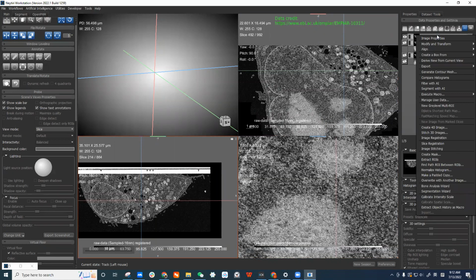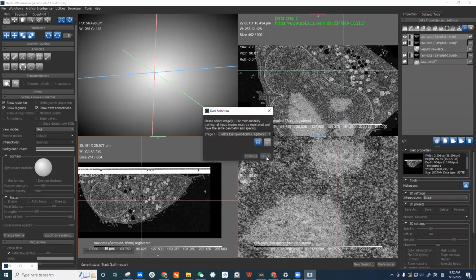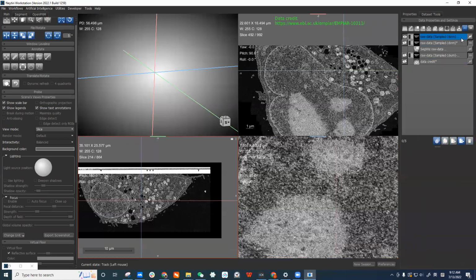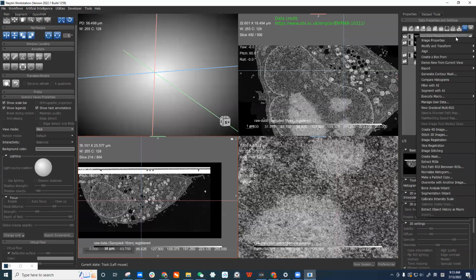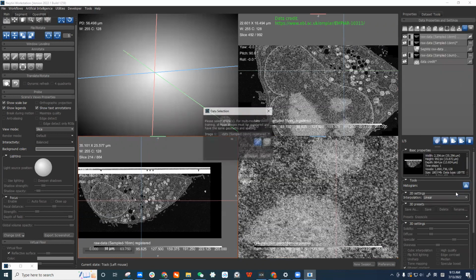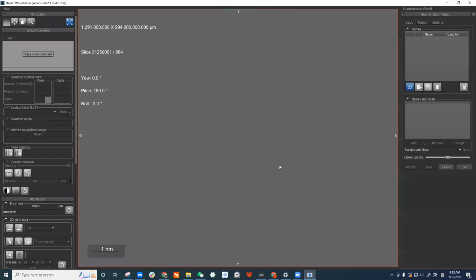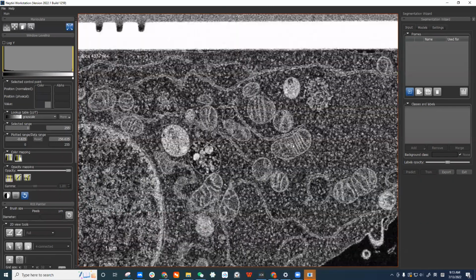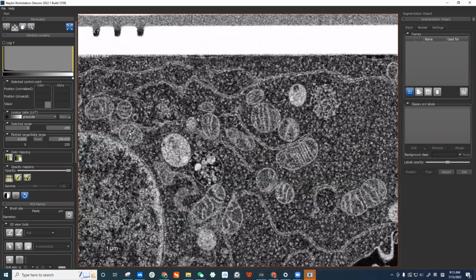I would try to do the segmentation by using deep learning. So it's by using the segmentation wizard, by right clicking the new dataset, which is registered already. So on the new registered dataset, I right click and start the segmentation wizard. And this is also a new standard workflow. We just want to try with this dataset.